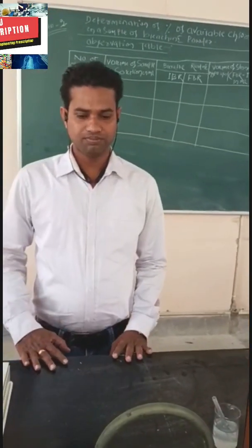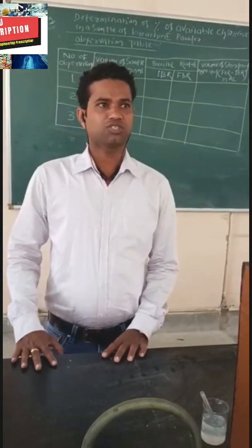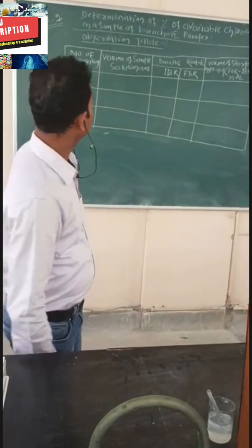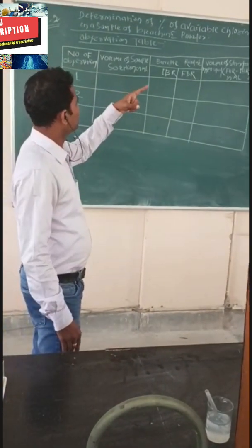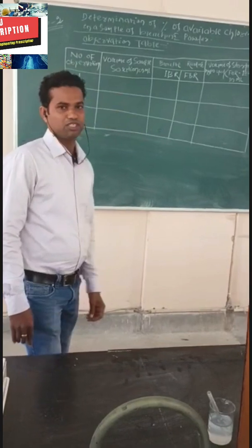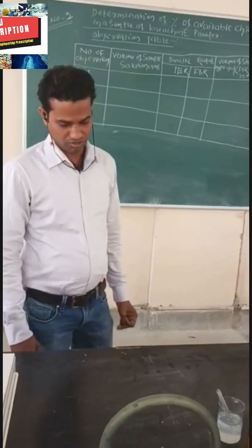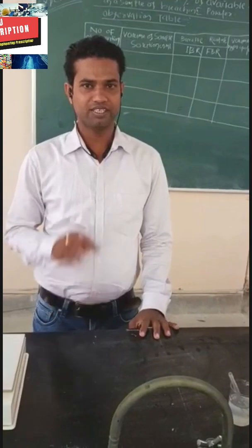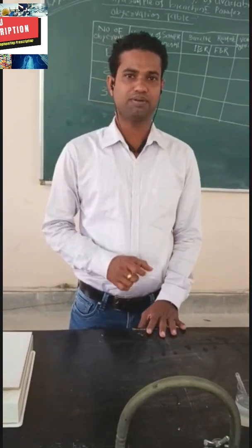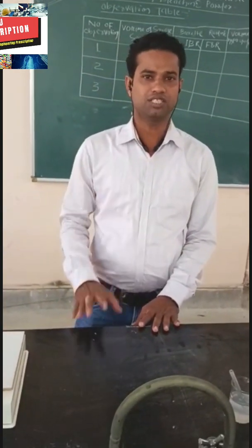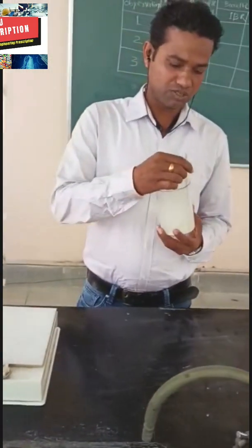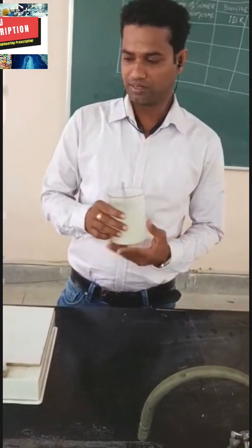Good morning. This is your second experiment. Today you will perform the percentage of available chlorine in a sample of bleaching powder solution. First, we prepare bleaching powder solution by taking three grams of bleaching powder and 250 ml of distilled water. This is the bleaching powder solution — it is already prepared.